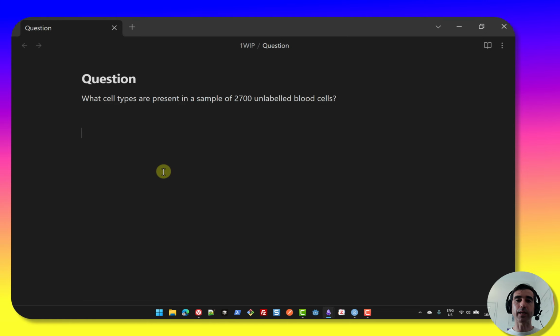And before we jump into the tutorial itself, I want to try to reverse engineer how we would be able to answer this question. And that's going to make following the tutorial more interesting, in my opinion, and also more clear. What would actually answer that question? Well, you saw it already. It would be a chart showing the types of cells, right? So that's where we want to get to. And we're going to get to that by using cluster analysis, in which we're going to take transcript commonalities and group the cells based on those properties.